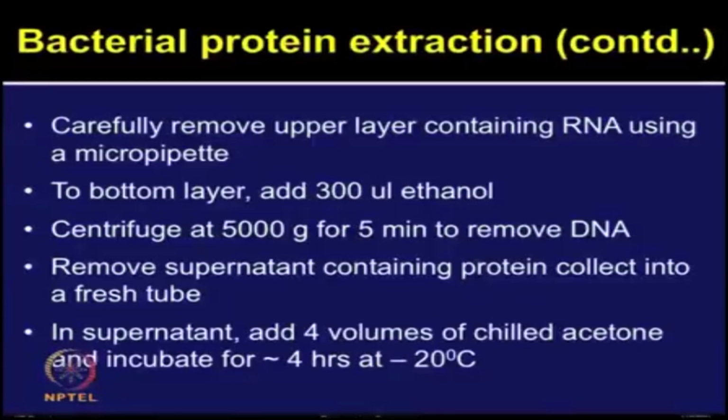This step will remove any DNA contamination. In fact, this step can be used for keeping the material safe for further DNA extraction. The same applies to the previous step, where you can collect the RNA which can be further used for RNA cleanup and preparation.